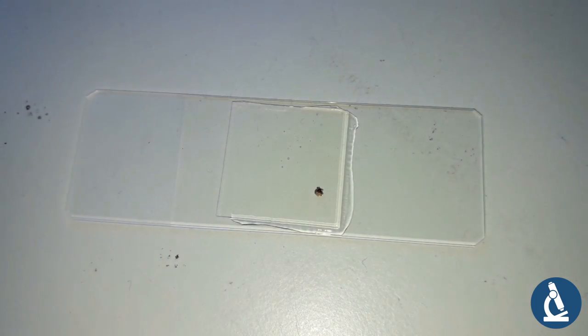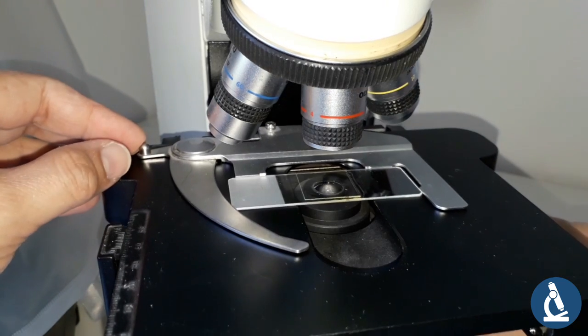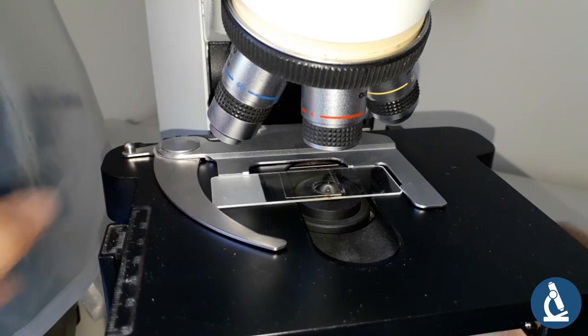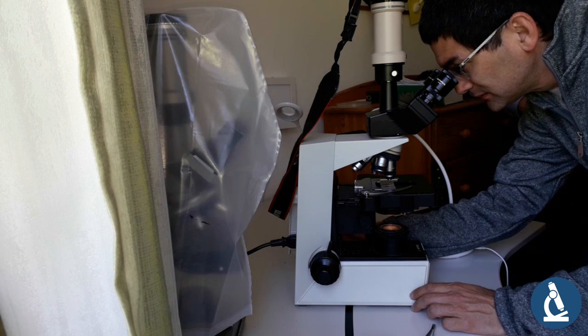Of course, everything will go under the microscope, and what I'm doing right now is observing it in low power. Ticks are quite large. This is a picture, a video that my kid made, so I had to include it as well.